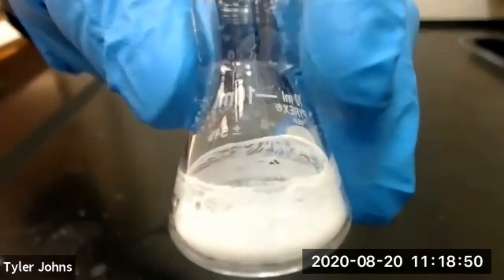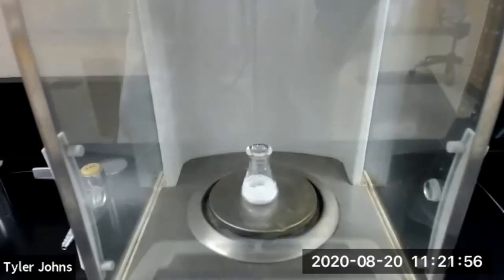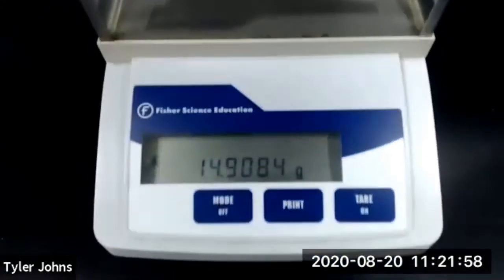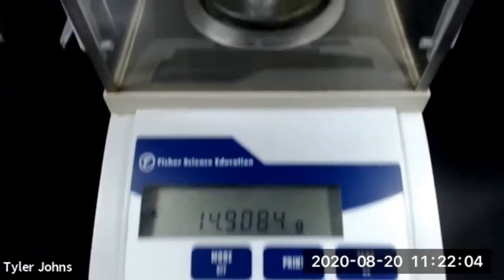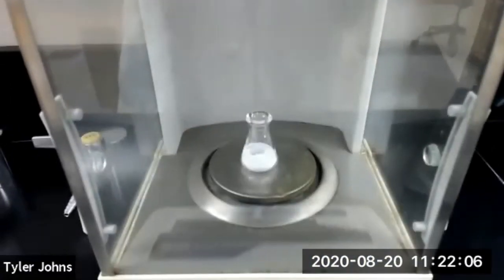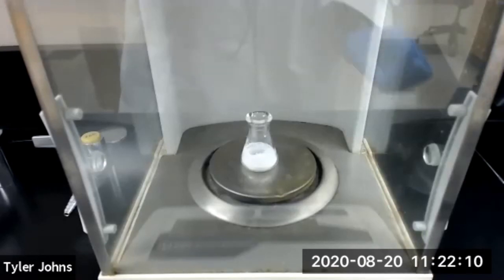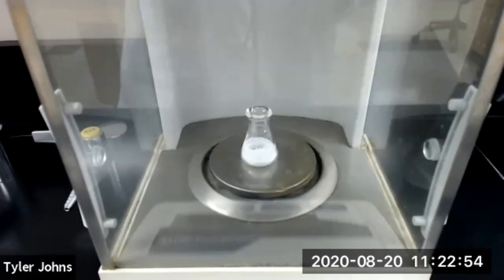The mass of our 10 milliliter Erlenmeyer flask and the caffeine is 14.9084 grams. You can now determine the amount of caffeine that was in the methylene chloride. This concludes part A of this experiment.